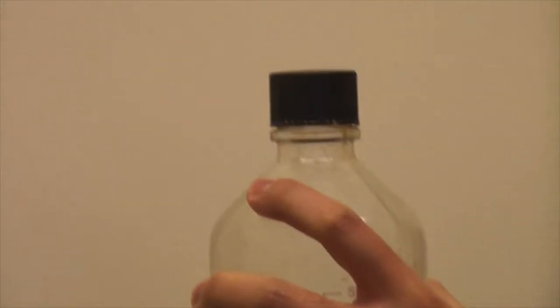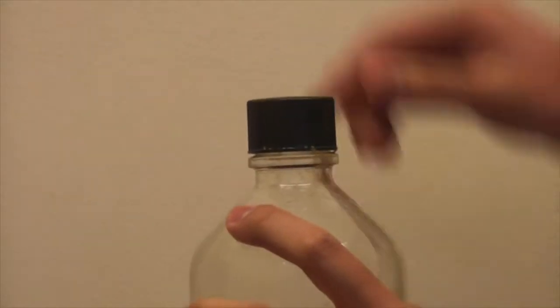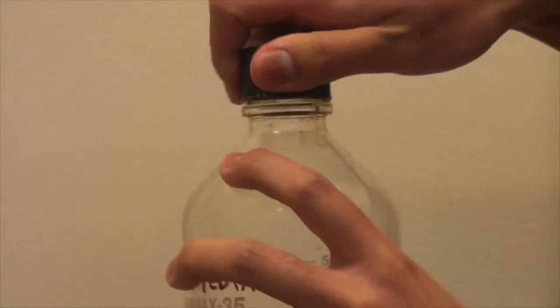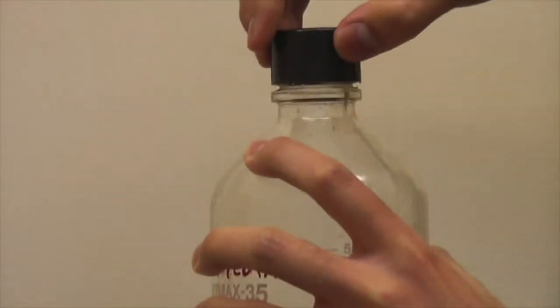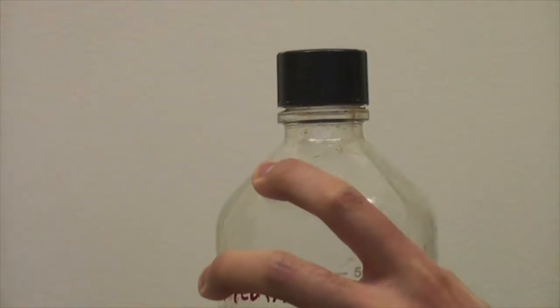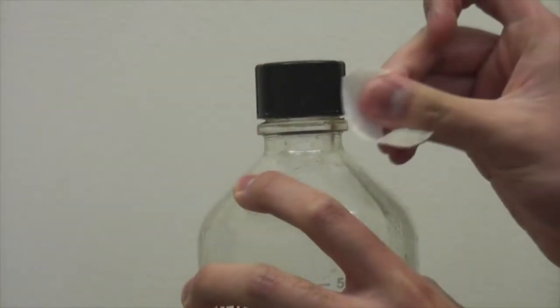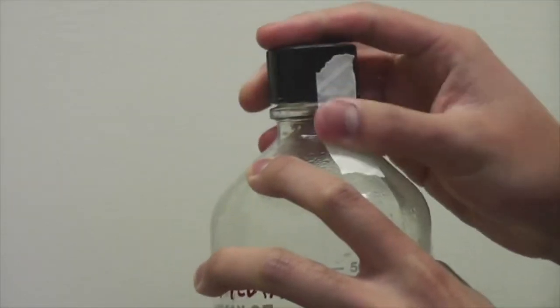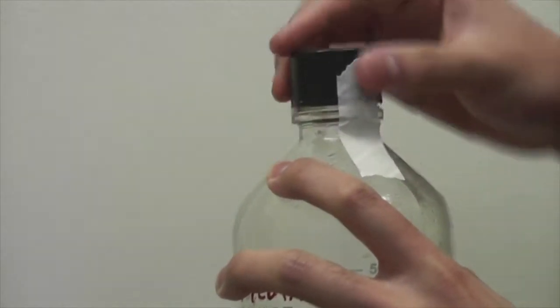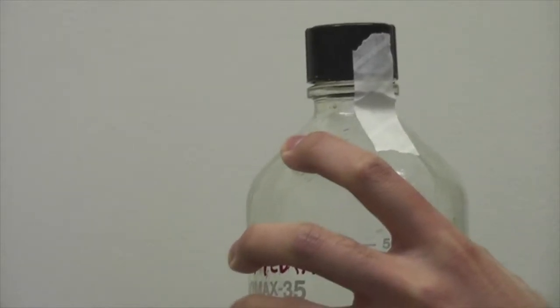When autoclaving liquids, ensure that the cap is not tightly screwed on. Do this by completely closing the lid to the bottle, then opening the lid on the bottle a quarter turn. Ensure that autoclave tape is placed on the bottle. More information on autoclaving and sterilization can be found in another Jove Methods video, Sterilization and Autoclaving.